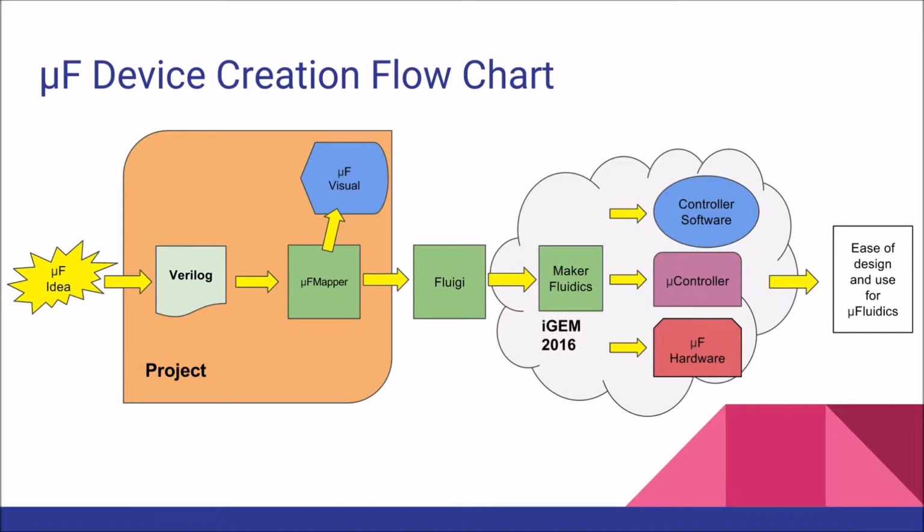Our project fits into the beginning of this overall flow, and the whole flow's goal is to ease microfluidic design difficulty and lower build costs. Of course, as I mentioned earlier, our project is more concerned with easing the design difficulty of designing a microfluidic device.